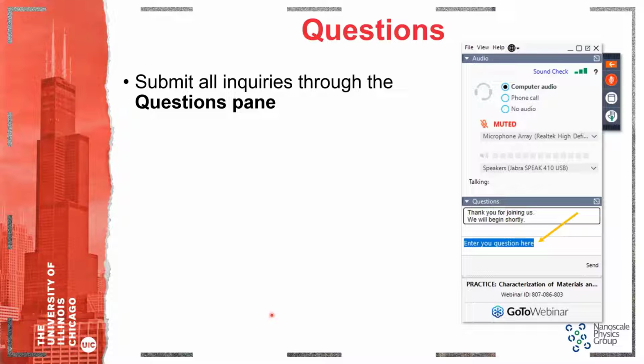Got it. And what was the size of the spectrum image maps that you were collecting? The total memory size? No, the image resolution of the mapping area. Yeah. So in the diffraction space, we were switching between 256 by 256 or 128 by 128, and in the real space, it was about 150 pixels by 150 pixels, around that range.